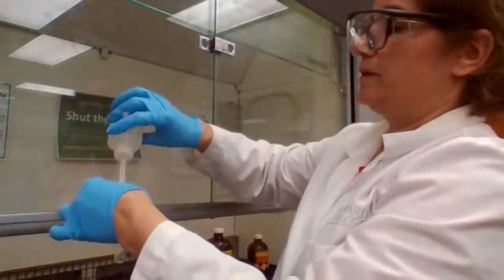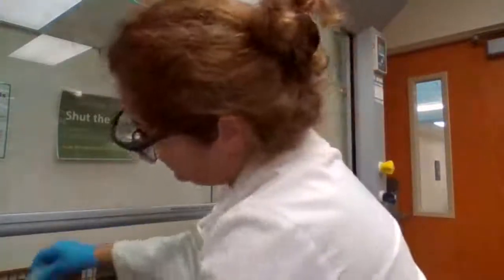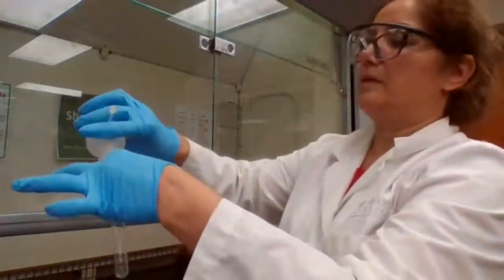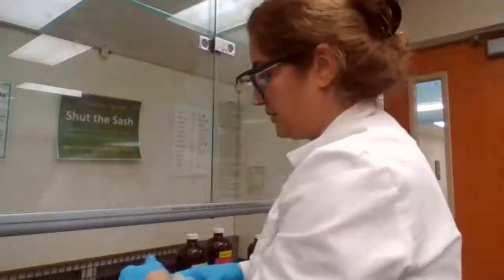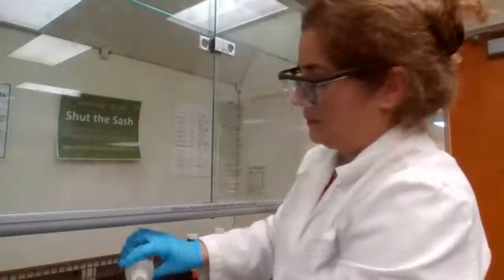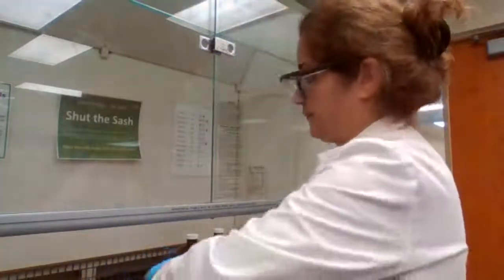Adding 3, 4, 5 drops of A to test tube A. 5 drops of B to test tube B, and so on. 5 drops of C to test tube C. Same thing for D.